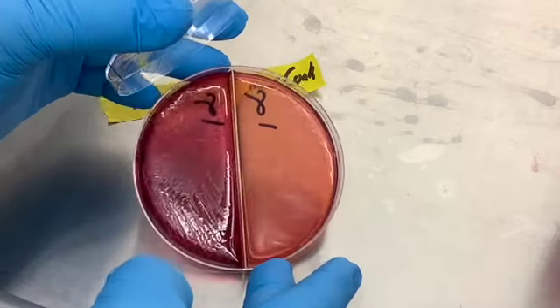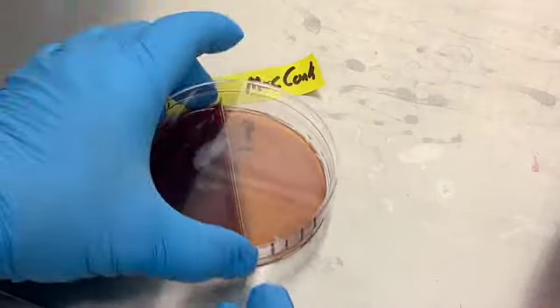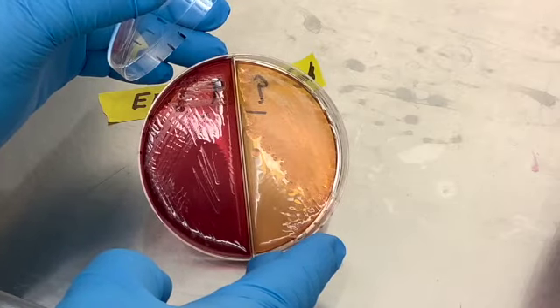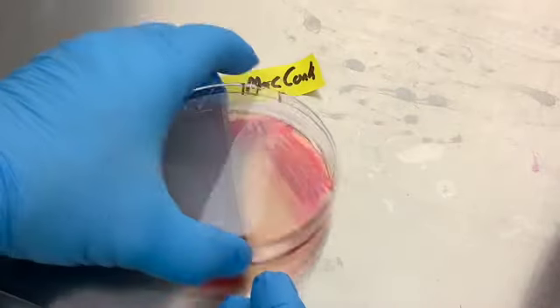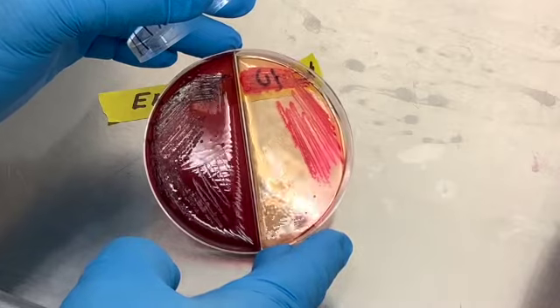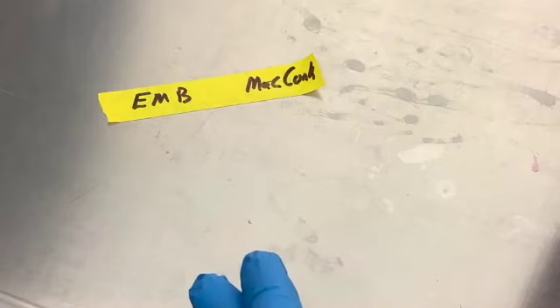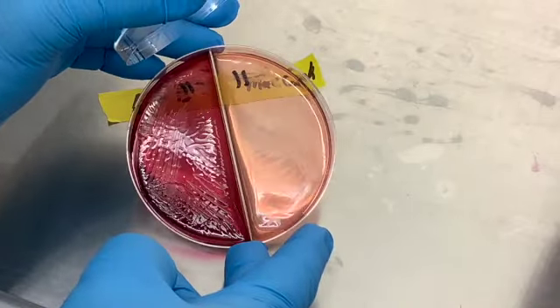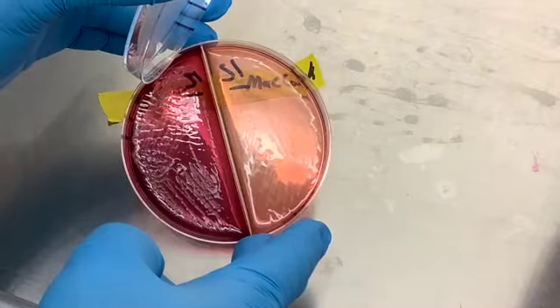Number 8, no growth. Number 9, growth on the one on the right. Number 10, growth on both of them. And number 10 has a red pigment, so that's not the pink color we're looking for in the coliforms. Number 11, no growth. And number 12, no growth.